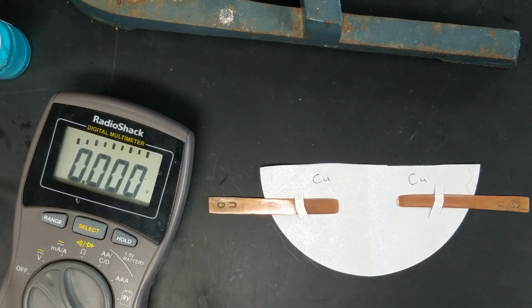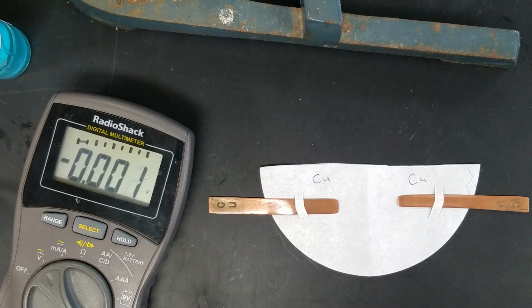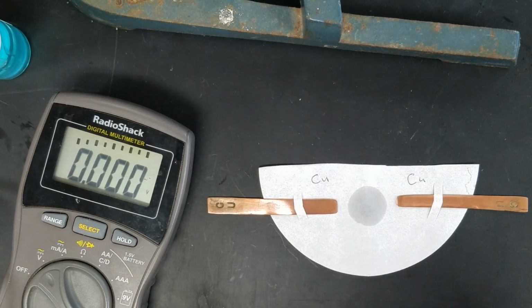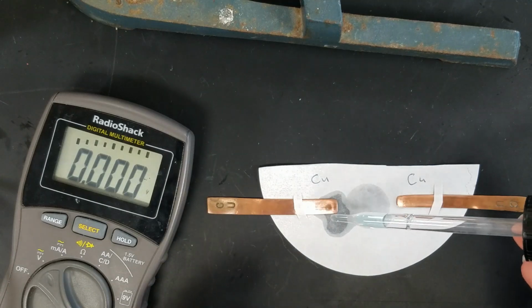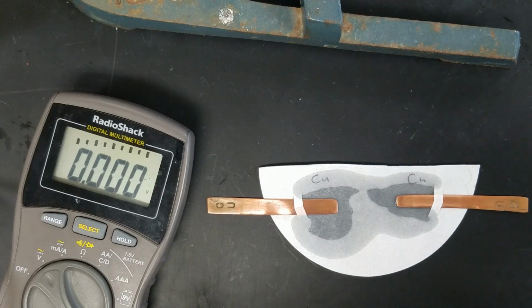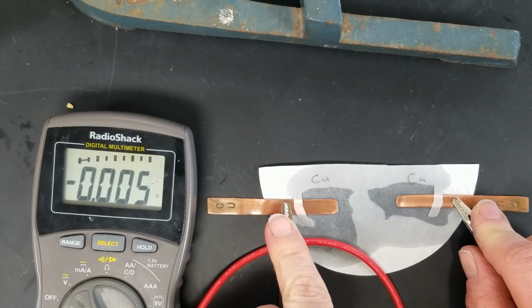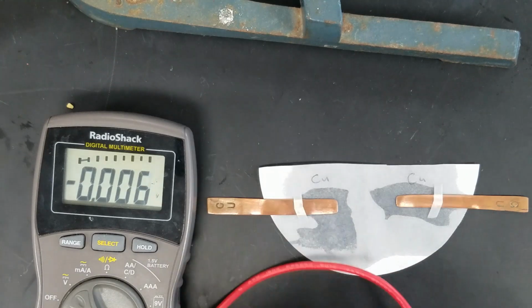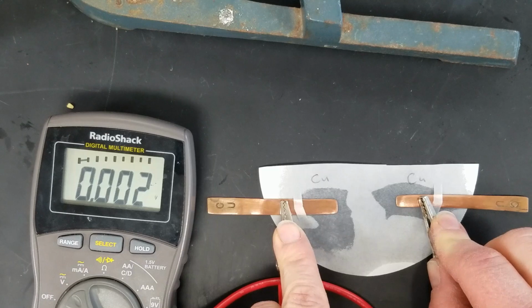We're now going to determine what happens when concentration becomes a factor. We're going to make a galvanic cell using our salt bridge in the middle, and we're going to do copper versus copper. I'm going to put 4 drops of our copper solution next to each one of our electrodes, and we are going to measure the voltage that we see. So you notice we're pretty close to zero.